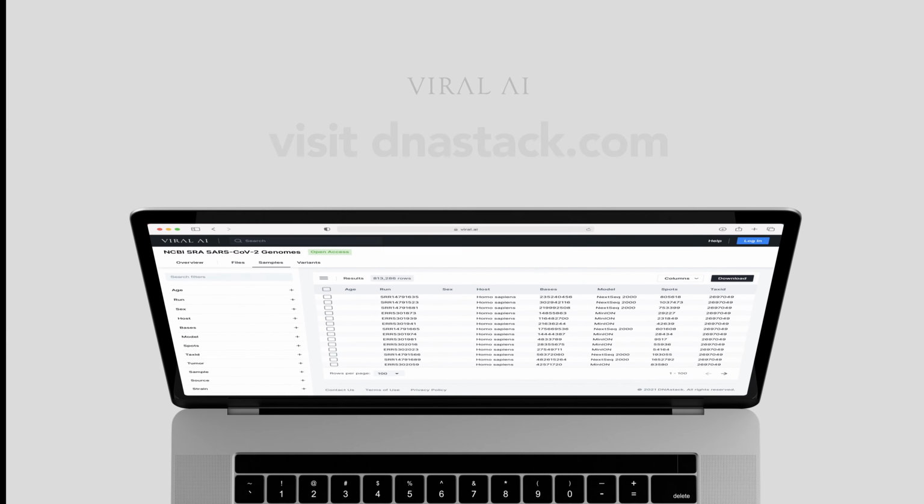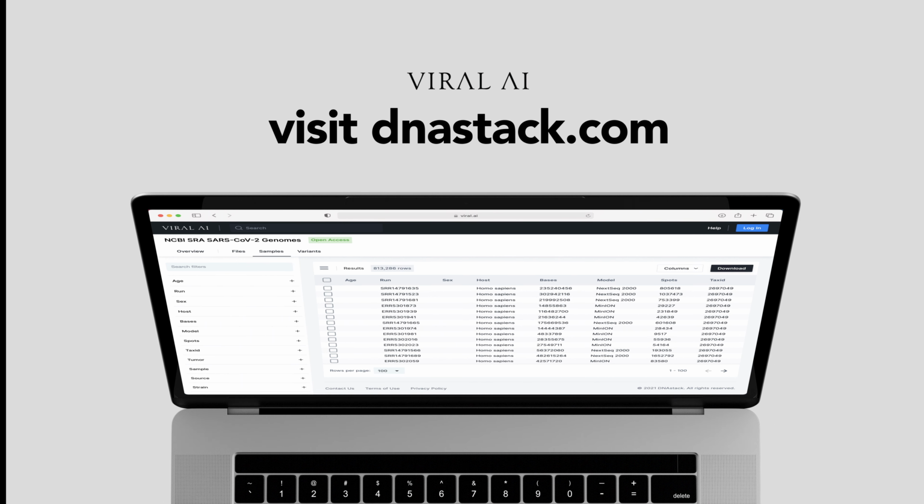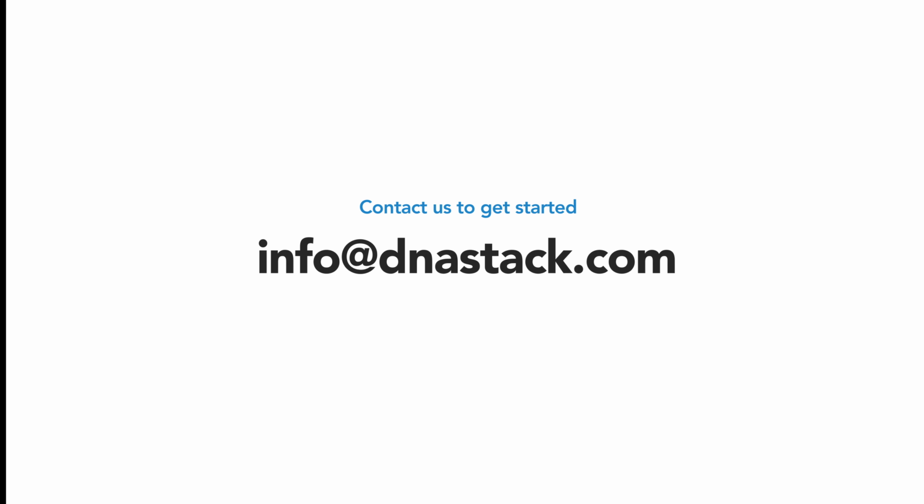Congratulations! You've now learned how to do bioinformatics processing on viral genomics data using Workbench. You can use this approach to run best practices or custom pipelines reproducibly and at scale.